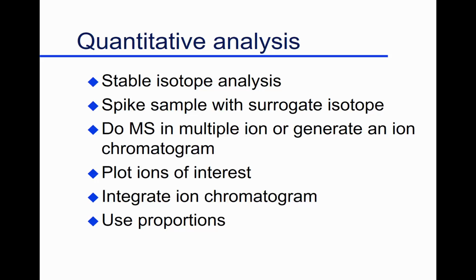Even if it's an isotope-labeled compound, it will still elute at the same time as your normal compound? Yeah, so let's say it's a mass of 106 and now it's 109. That's a really small change. There may be a really subtle difference between them. And you would expect that because your mass spectrometer is monitoring 106 and 109. It will pick up. So it comes off your instrument a hair earlier. It elutes a little bit faster off the gas chromatograph, the 106 and 109. And they fragment just a little bit differently, but it's so close, there's no better alternative.